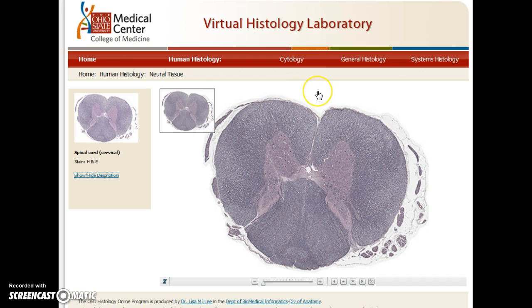So if this is anterior, and remember that anterior is the same thing as saying ventral. So we also have what's sometimes called the anterior horn or ventral horn. That would be of the gray matter. Then we would have the anterior column. Anterior column is white matter, and so kind of from this area to the median fissure would be one anterior column, and then from the median fissure to this horn is the other anterior column.